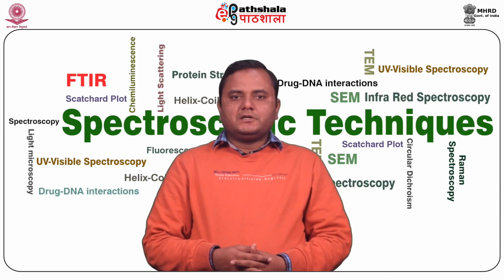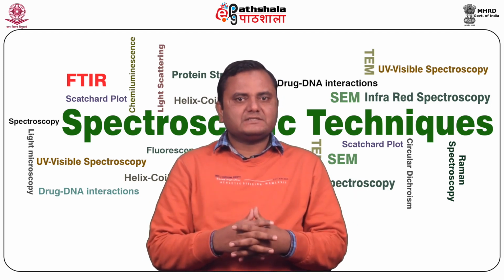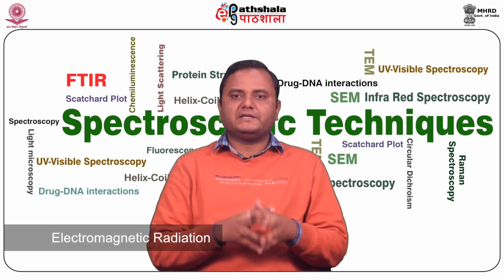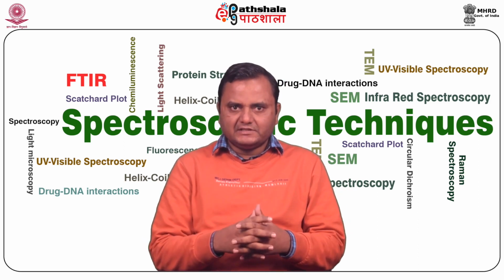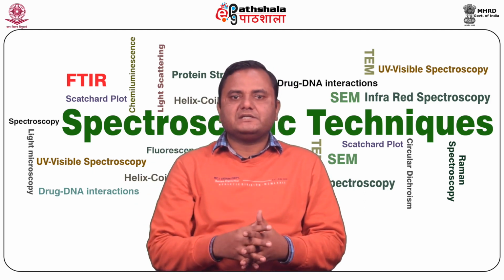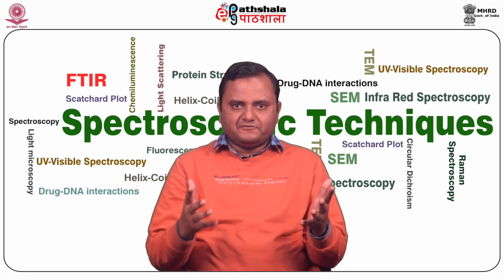So let's start with the basic concept of fluorescence spectroscopy. You know that fluorescence is a simple process in which atoms or molecules are excited by the absorption of electromagnetic radiation, which has a certain amount of energy to excite the electron. The excited species then try to relax to the ground state, and in returning to the ground state they lose some energy in the form of a photon, and that is termed the fluorescence phenomenon.